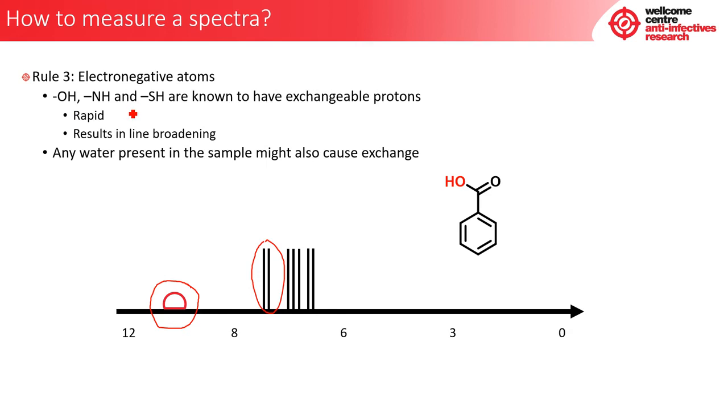So taking here, we have the example benzoic acid. And now what we're doing is we're focusing more on this OH. Now this OH is attached onto the carbonyl species. And we said before, so let's start using our rules. Rule number 1, where in the spectra would this fall? We knew that acids fall between 8 to 12. So we're talking about this region here.